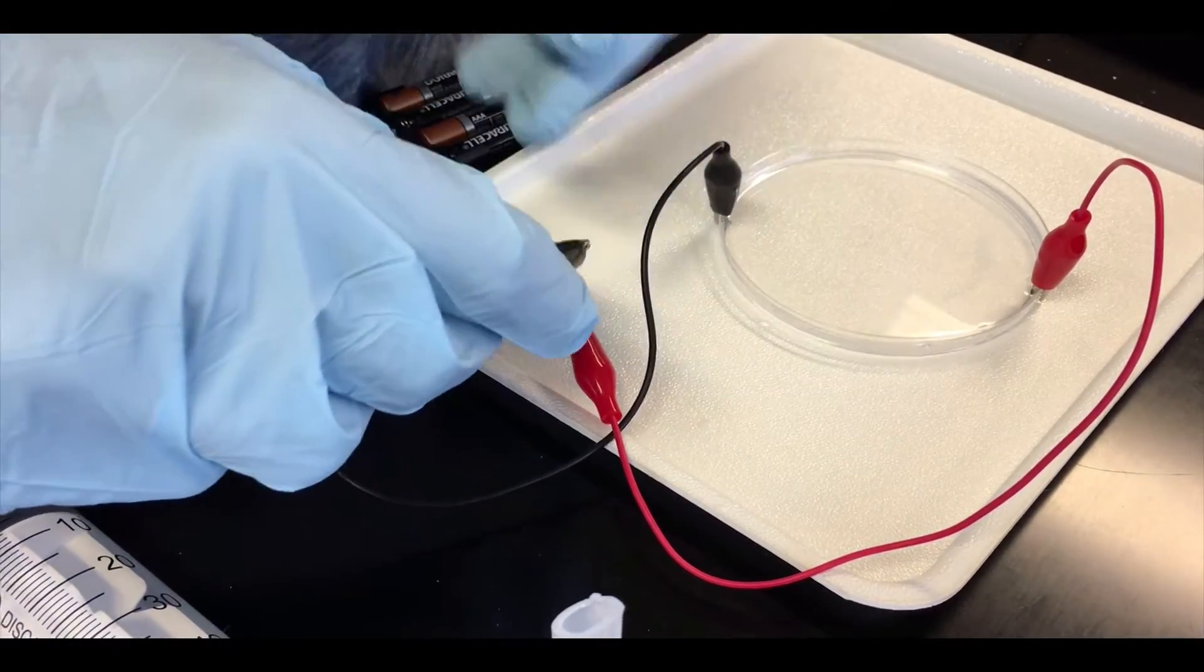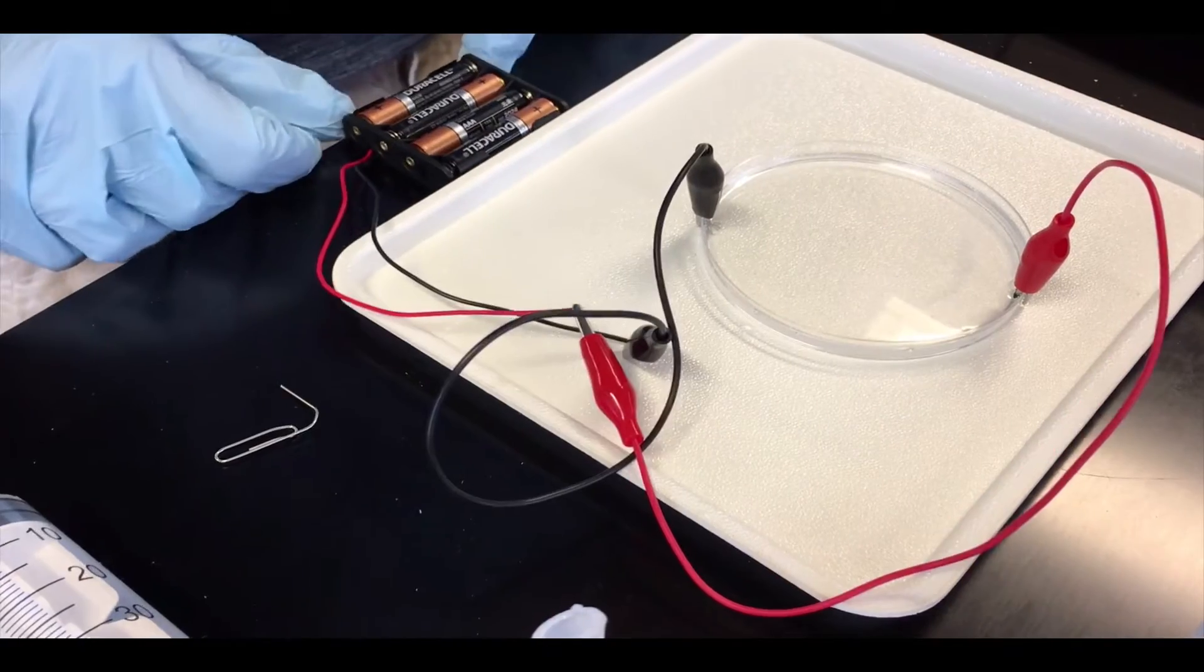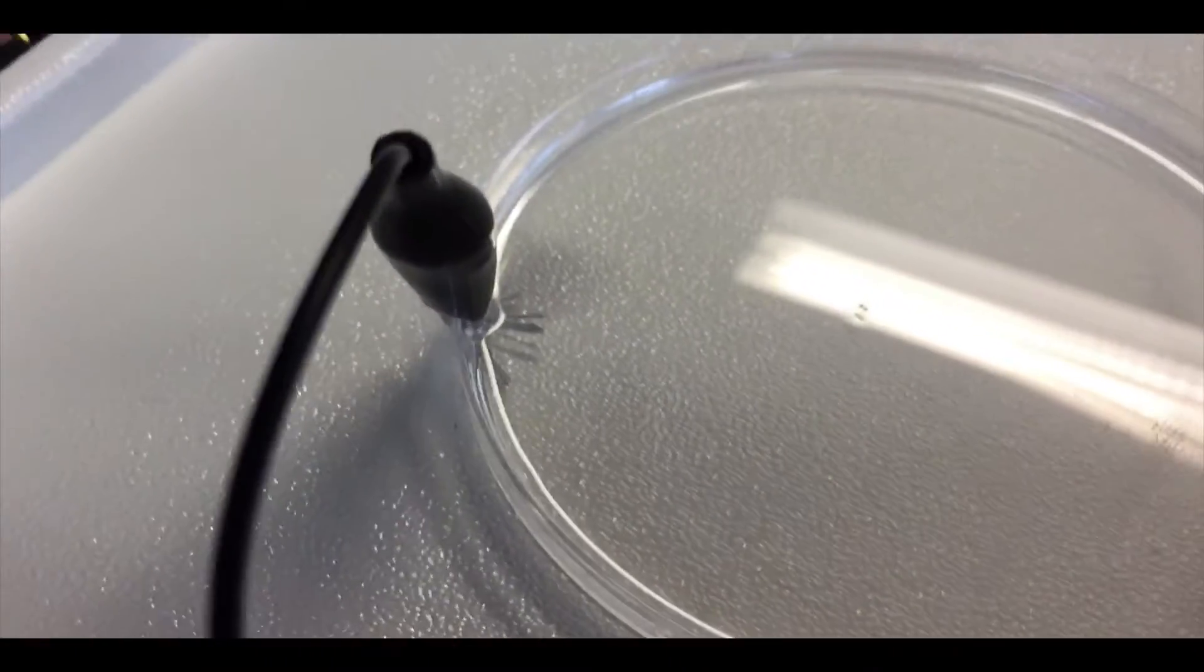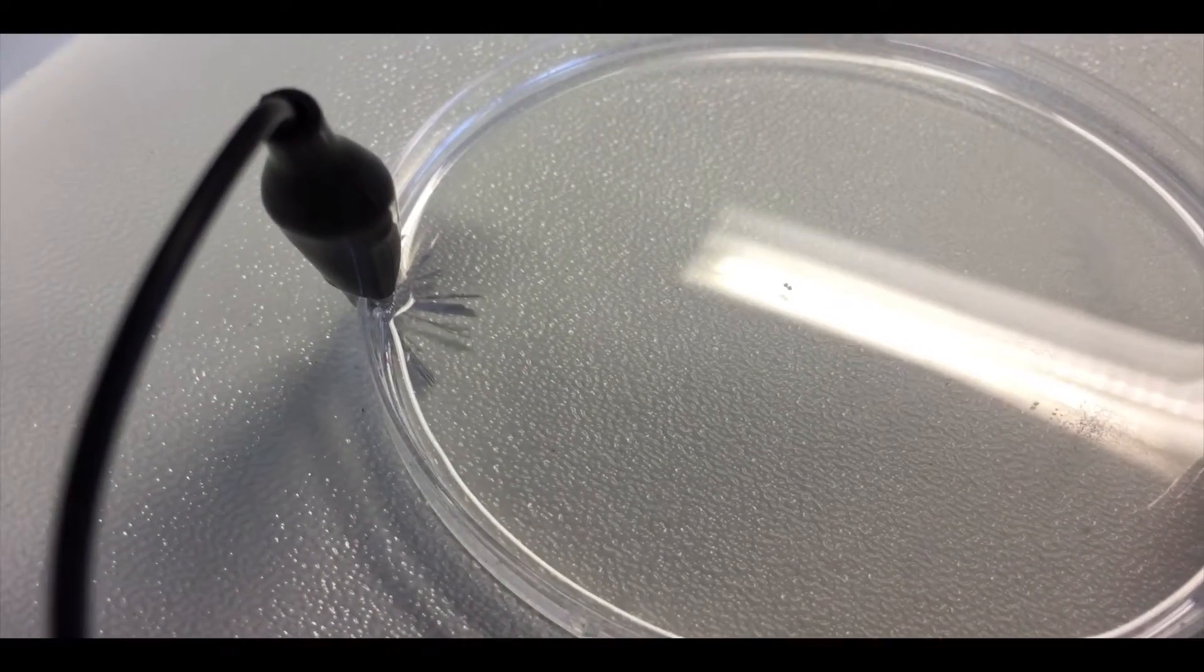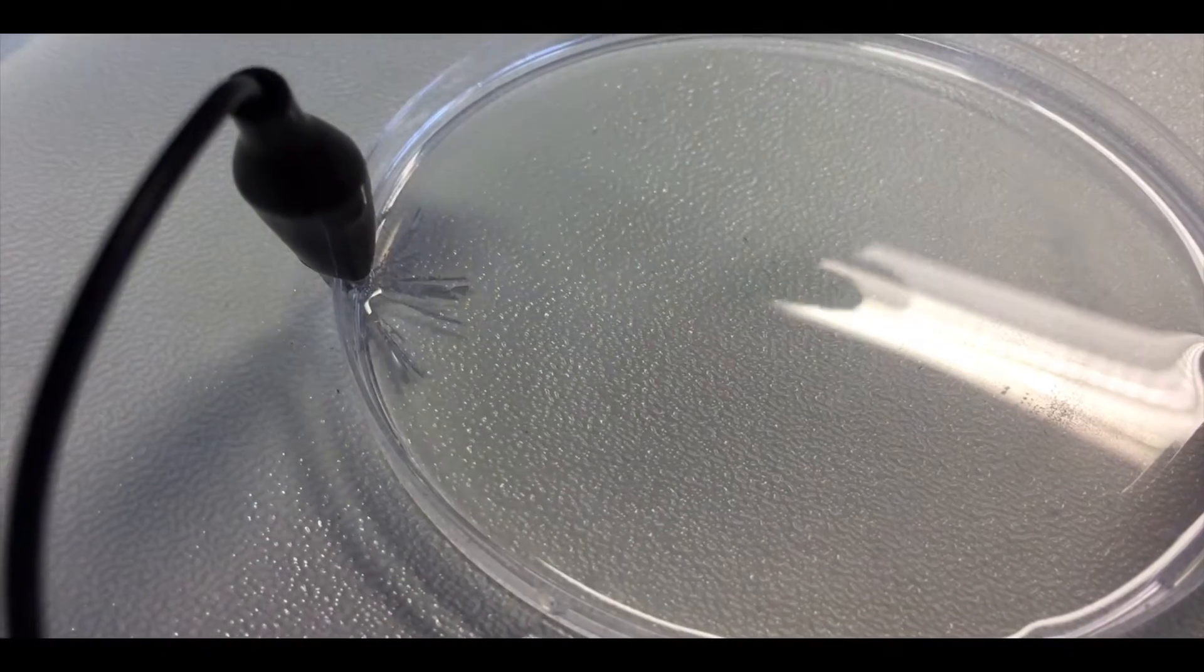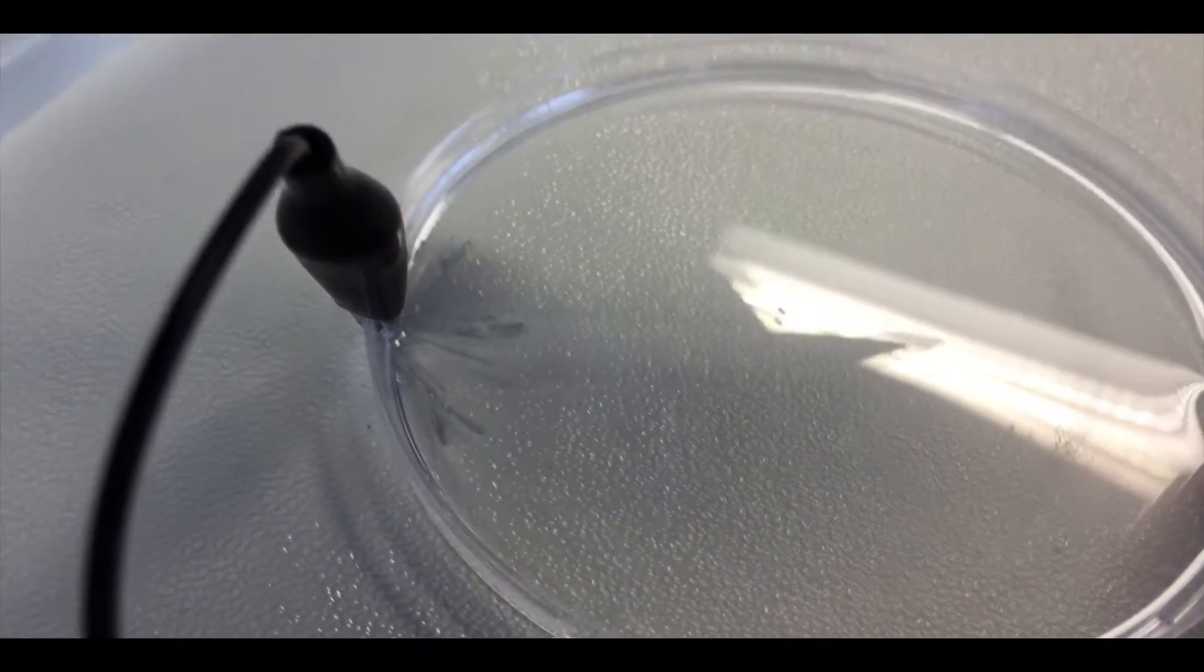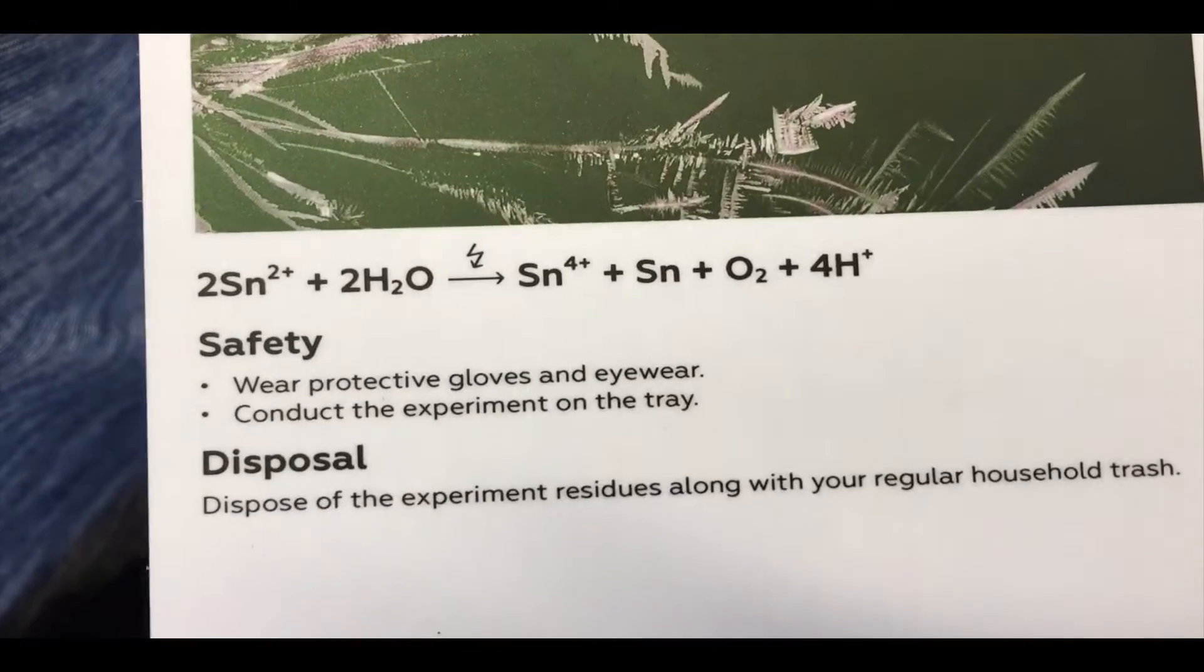The electrons are going to come out of the black lead, so we should see tin growing. Do you see it? Yep, there's already tin growing from that lead. Essentially electrons are coming out of there and they are reducing the tin-2 that's in there to tin metal. Here's the reaction if you want to share that.